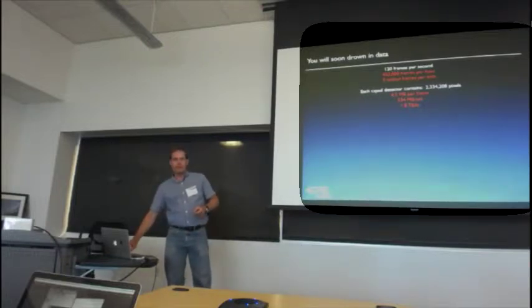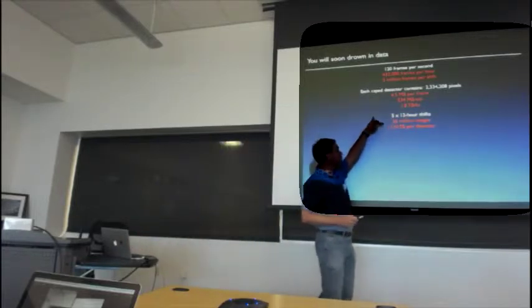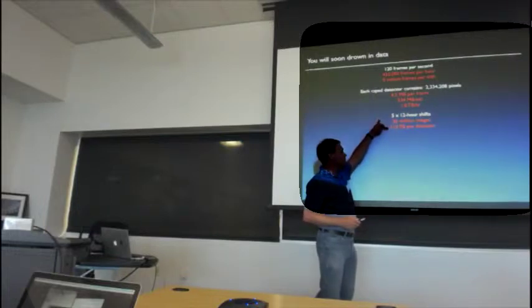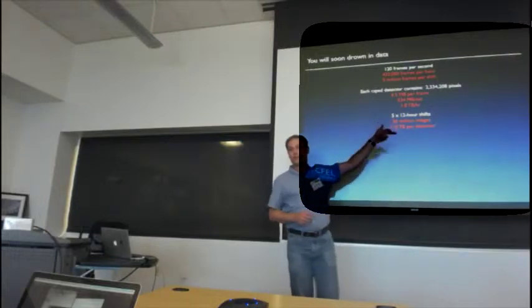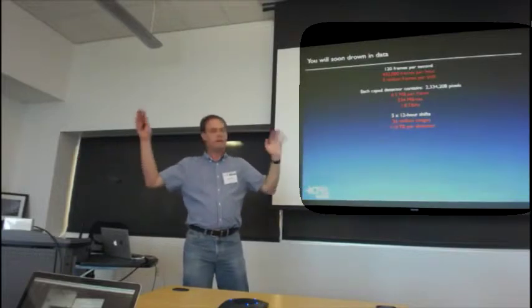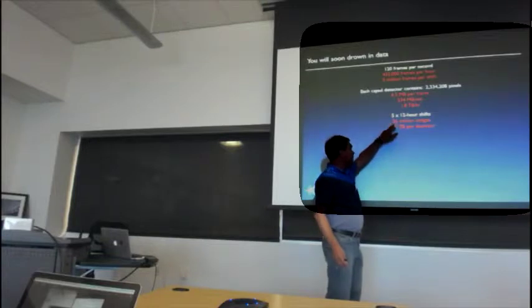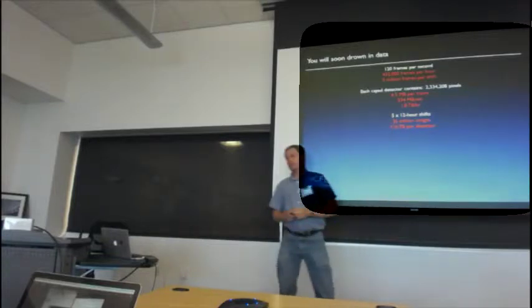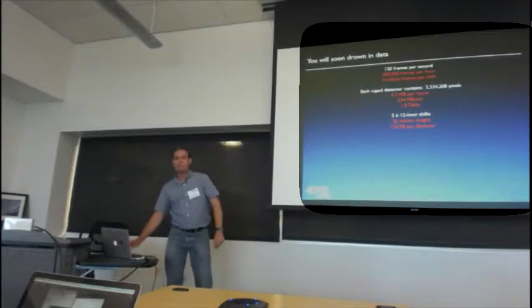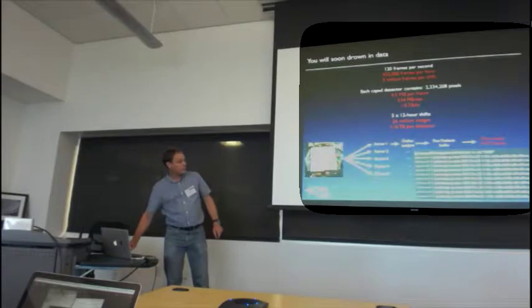So 1.8 terabytes an hour, and if you add up the amount of beam time, you're rapidly going to get into the tens of terabytes. Typical experiments are 5 by 12 hour shifts. We'd go home with 26 million images and 110 terabytes per detector. Sometimes we're running 2 detectors, but your detector doesn't always run, you have experiment downtime. So we have taken home, I think, from one of our longer experiments, 140 terabytes of data, which is fairly intimidating, and you fairly quickly buy large hard drives to deal with that.